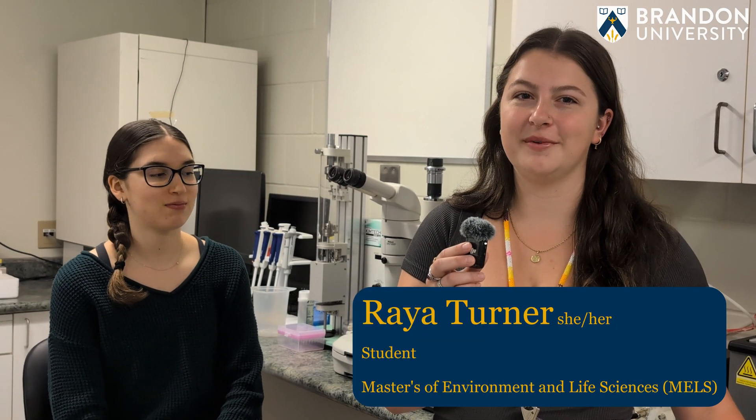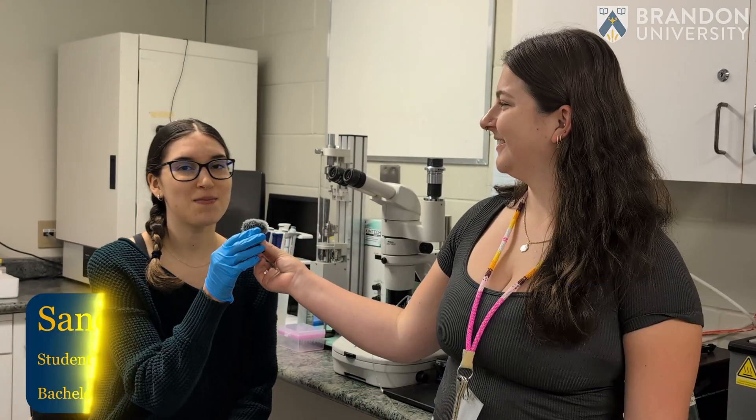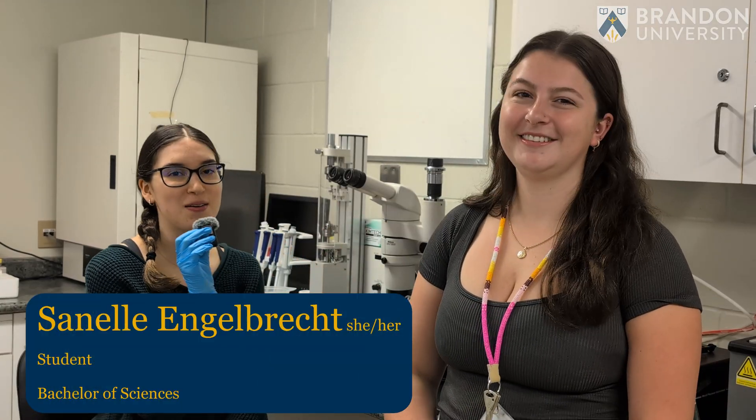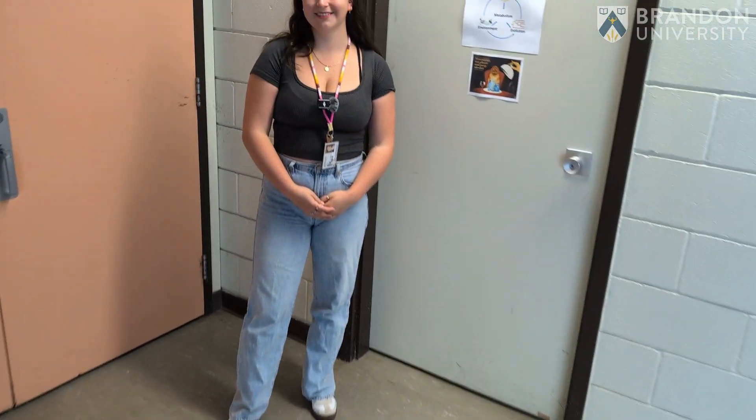My name is Raya Turner. I'm a student in the Master of Environmental and Life Sciences program here at BU, and today I'm with Sanelle Engelbrecht. I am going into my third year and I'm also doing my four-year bachelor's of science degree. Today we're going to give you a little mini tour of our lab and let you know about how we do some zebrafish micro injections.